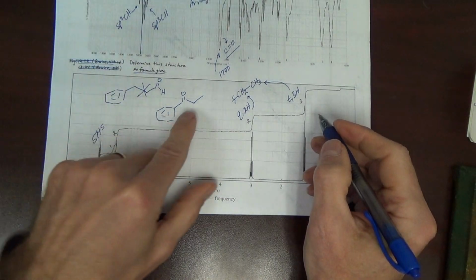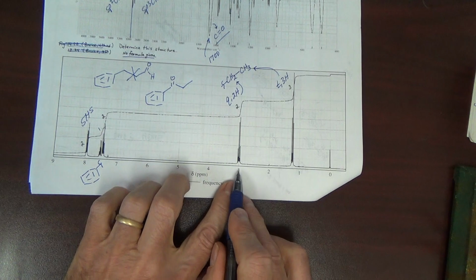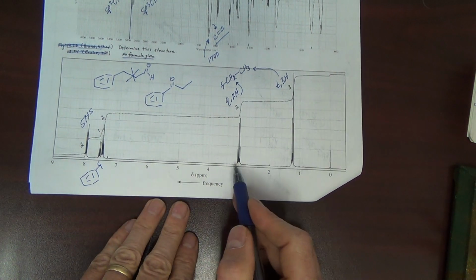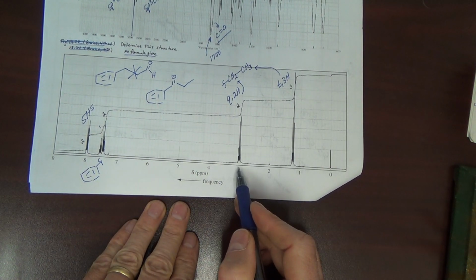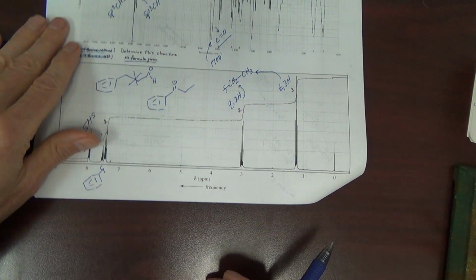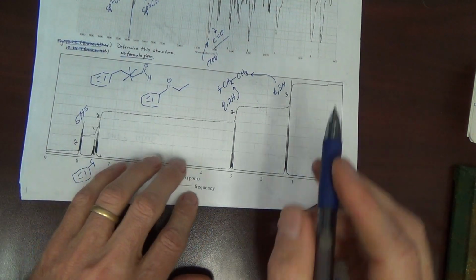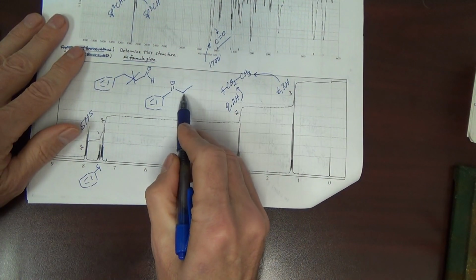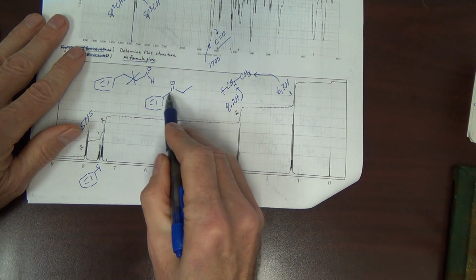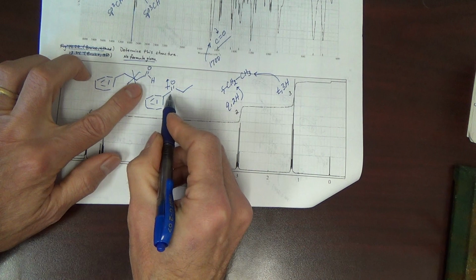Let's confirm this. With this CH2, let's talk peak position. It's about 3. What makes this move downfield to about 3? Next to carbonyl. Next to carbonyl, electron withdrawing, it's deshielding here because of this dipole pulling away.